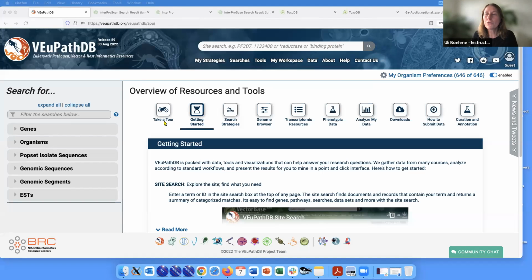Okay, thanks very much, Omar. So in the next exercise, which is optional, we are going to look at Apollo. You've heard already a little bit from Jesse and from Omar about Apollo. Apollo is an extension to JBrowse. In JBrowse, you looked at gene models and at evidence, and you were able to tell if a gene model was correct or not. What is lacking in JBrowse is the ability to edit those gene models, and this is something that you can do in Apollo.